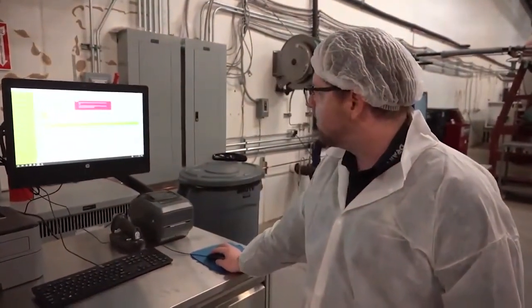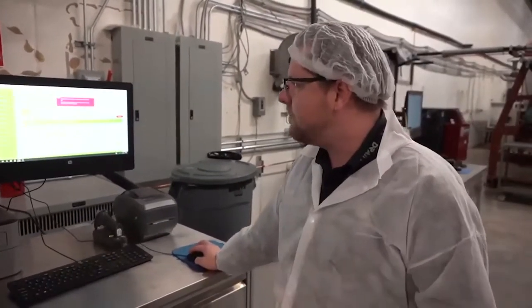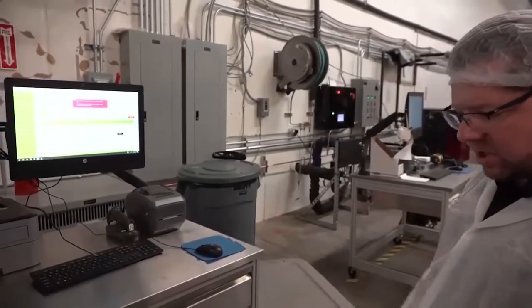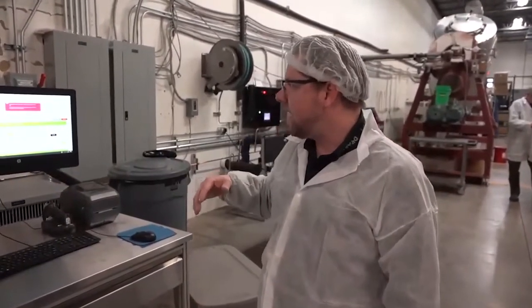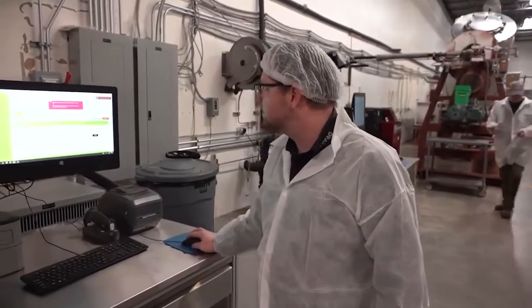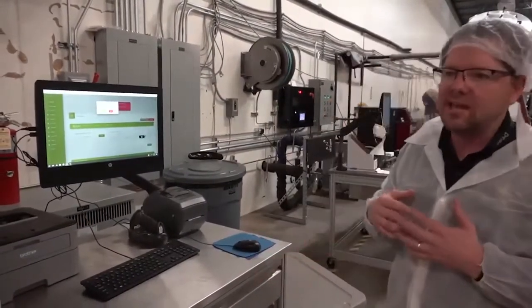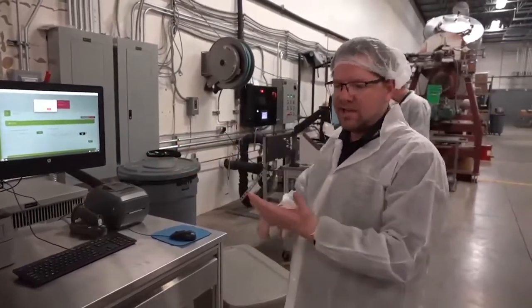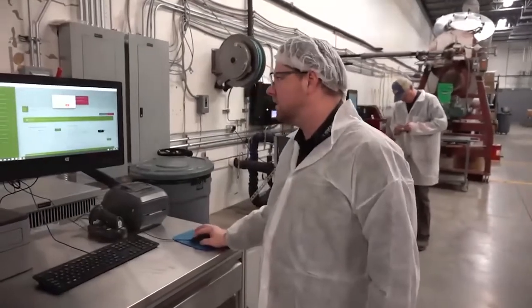And here I can show you basically starting a process. What's cool about it is that I can assign equipment to this. So anything that's in this work cell, if you will, has equipment assigned to it. In this case, we have some scales assigned to it. We select the scales, and then we also select whether or not it's calibrated or cleaned. That's where we're taking a lot of the records that are associated with cleaning and calibration and doing daily updates on them. And that all goes into a database. So it's pretty nice along those lines.